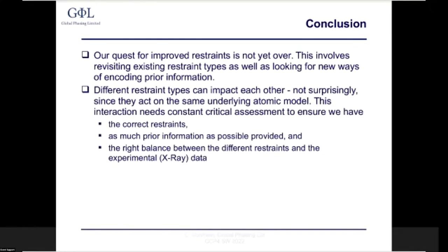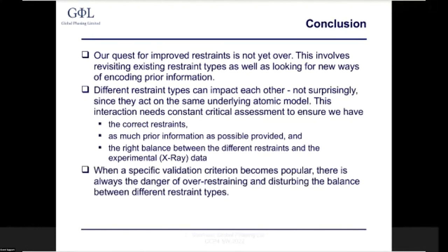geometric restraints. We need to take special care when our restraints are closely related to a validation criterion. There's always a tendency of taking a validation metric as a target for refinement, with the result that it becomes useless as a check of model quality. That is why we usually don't use Ramachandran restraints during refinement. We should probably also place rotamer restraints into the same category, because invalidating a validation metric robs us of a very powerful tool for sanity checking.